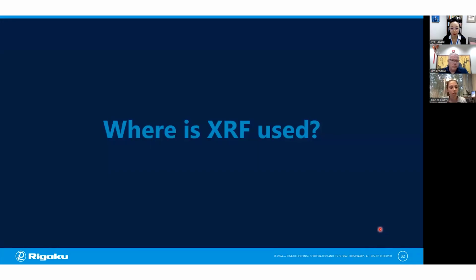And I think that's going to bring us to our next section. Do we have any questions, Tim? Yes, we have another question. Do I need to worry about adjusting the pass-fail threshold after switching from ICP to XRF?